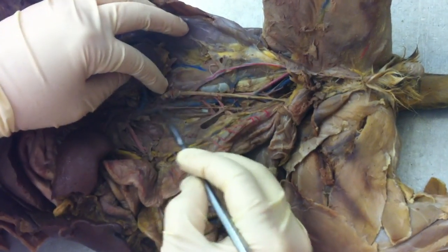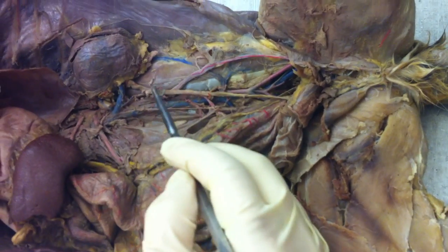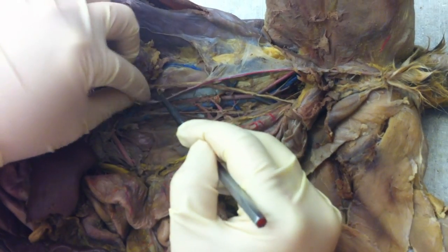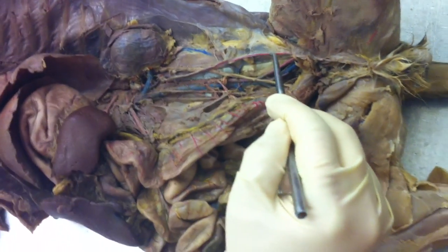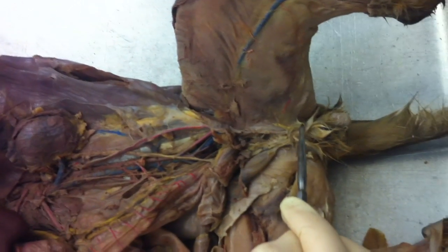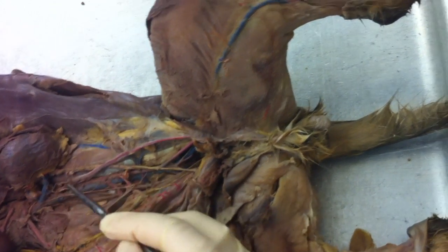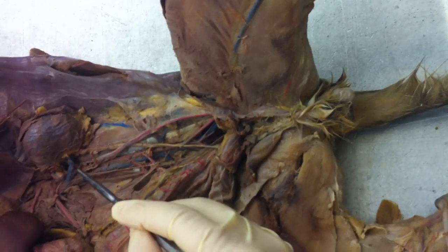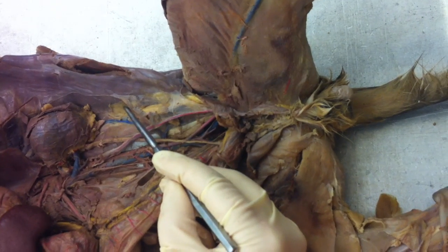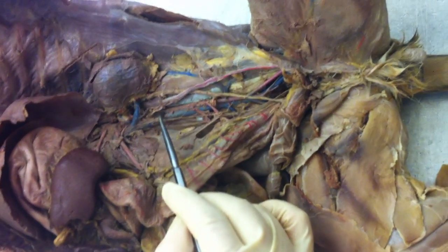Coming off of the renal, it's a little bit different than your diagram. But coming off of the renal is this one that's broken on mine. Sorry. Here we go. This one, it's broken on mine, but you can see where it would have attached right there. It looks like it's going down, down, down through an inguinal canal, down to the spermatocord. What should we call that one? Spermatic or ovarian. The spermatic or testiculars, both of those are acceptable, or the ovarian. And the ovaries were right in this area right here, so they would kind of take a different direction a little bit. Okay?